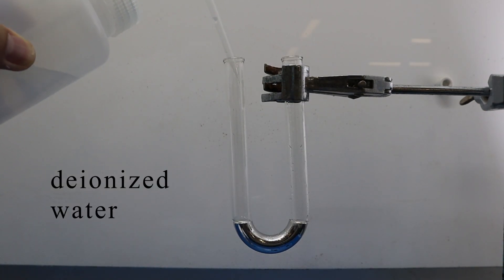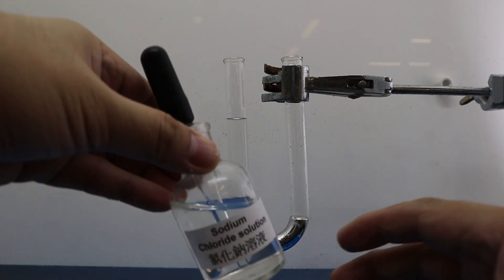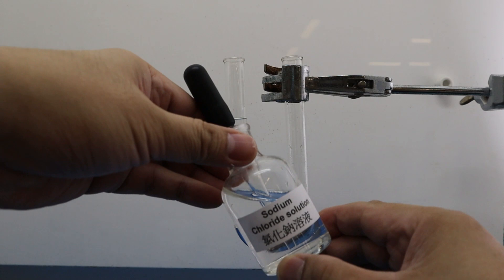Then the deionized water is added to the left-hand side of the U-tube. Concentrated sodium chloride solution is added to the right-hand side of the U-tube.